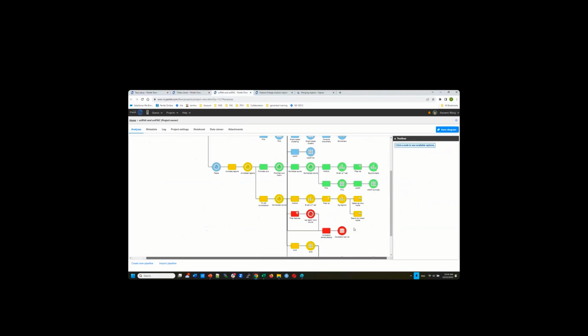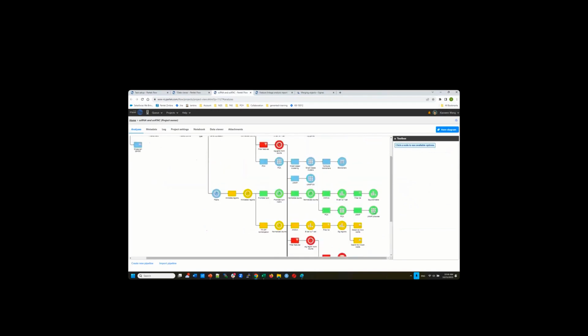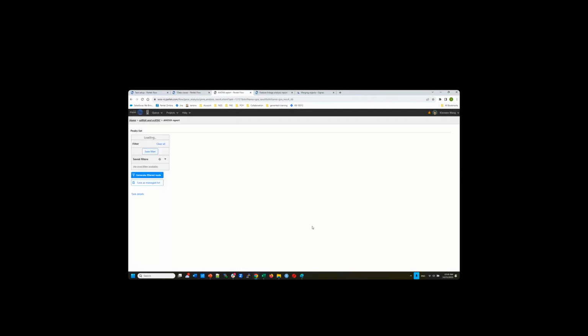Now I want to talk about once the cell type is identified using all those techniques we learned before. Besides performing differential analysis on the gene expression, we can also perform differential analysis at the peaks and also at the promoter regions. So this is the peak information, differential analysis.